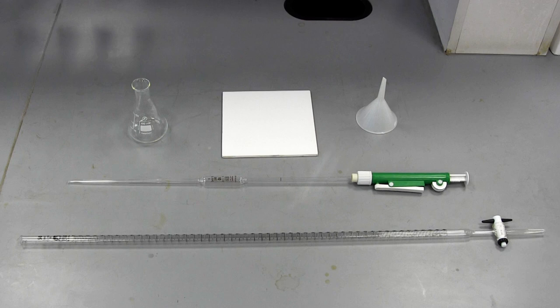Here is the equipment I will be using. The pipette is used to accurately measure the volume of one of the solutions — it has a set volume; this one is 10 millilitres. The pipette filler is used to draw the solution up into the pipette. The burette is used to deliver the other solution. We don't know how much solution we will need, so it is a long, narrow tube with graduations. The tap on the bottom allows us to regulate the flow of solution into the reaction.